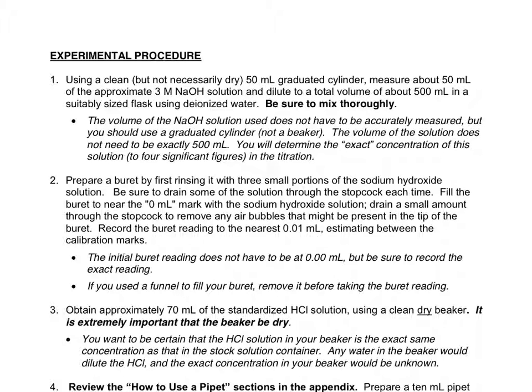It says transfer 50 mils of stock solution. I always like bases in the middle hood, acids in the first hood, so your NaOH is in the middle hood. I have a transfer beaker in there. Let's be sparing with our NaOH so I don't have to scramble and make some more up. So if you could just take the 50 mils you need, that would be great.